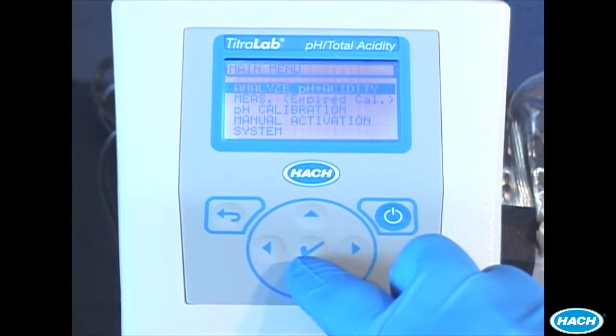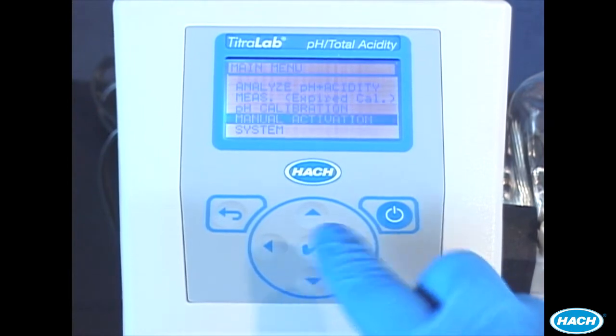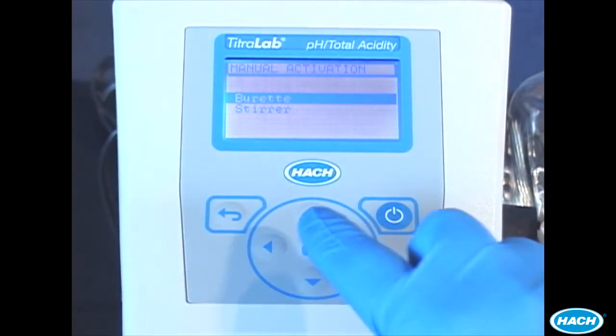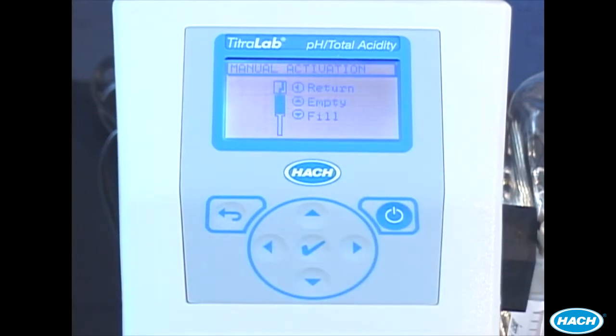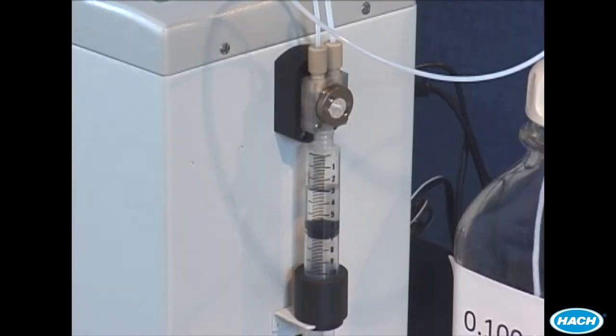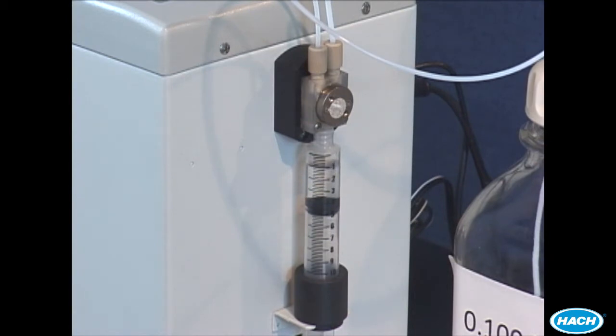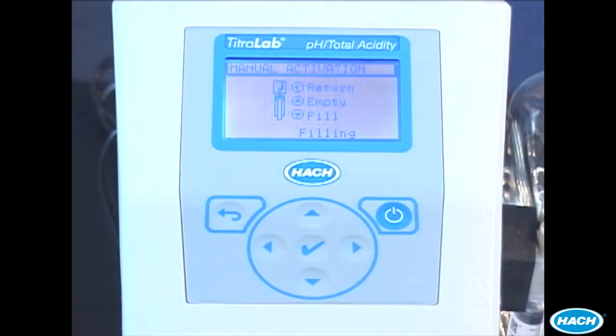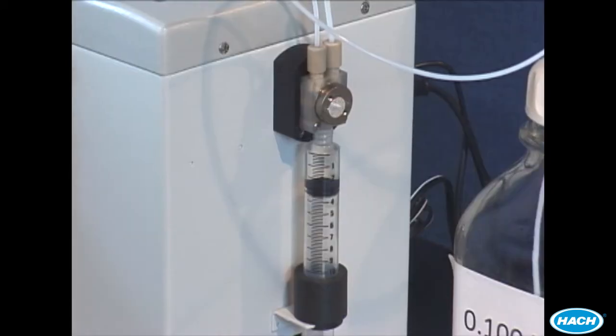Select manual activation, burette and empty. The piston inside the burette will travel up. When the burette has stopped press fill. Repeat the empty and fill procedure to ensure all the tubes are filled with fresh titrant.